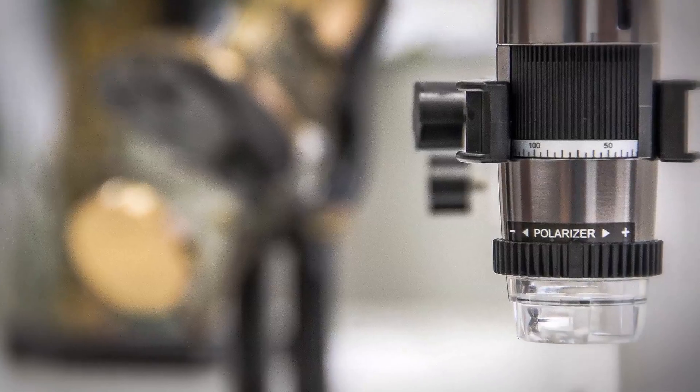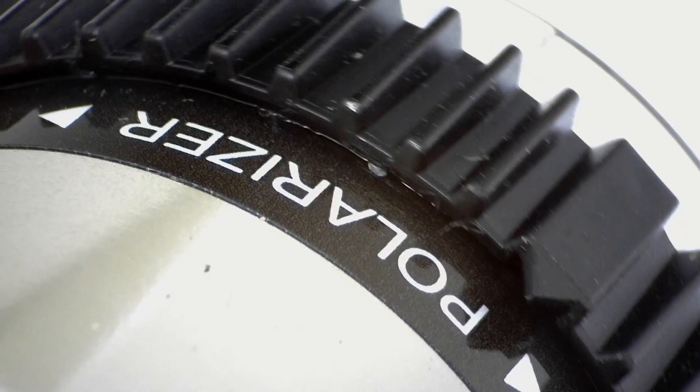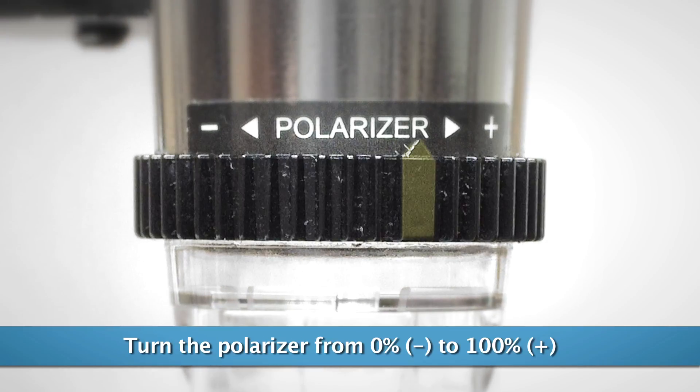Dynolite models with a built-on polarizer can help to reduce glare and provide the clearest possible magnified images. Looking closely, you'll notice the indicator of the polarizer's current location.